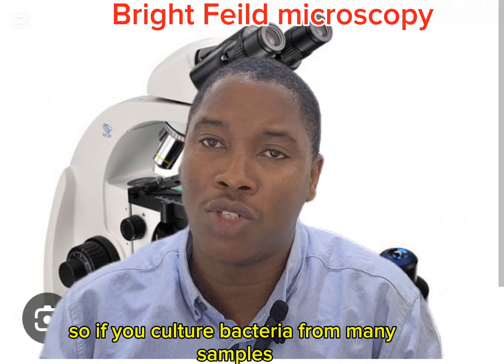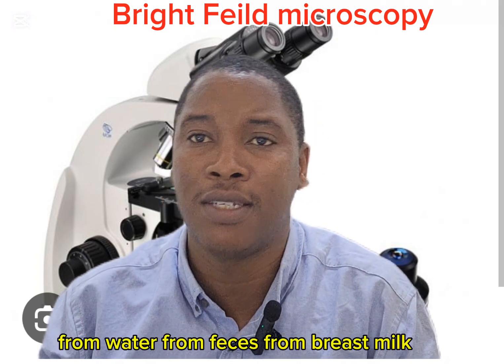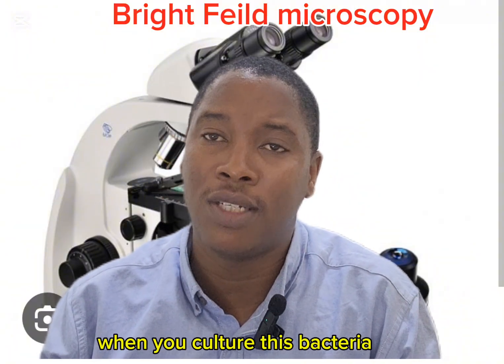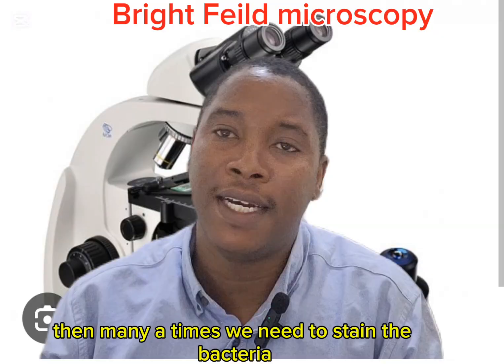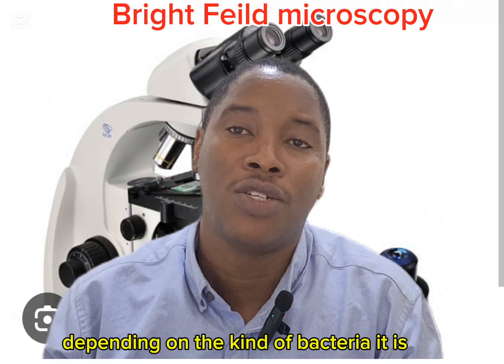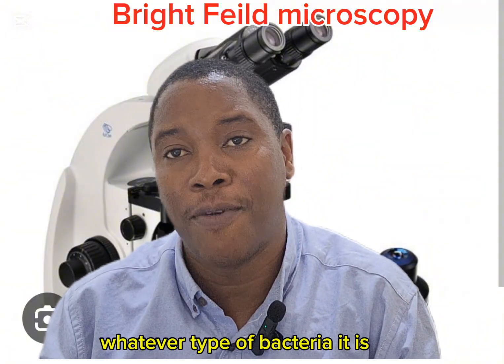If you culture bacteria from samples, from soil, from water, from feces, from breast milk, from whatever sample you're taking, many times we need to stain the bacteria depending on the kind of bacteria it is. So we could do gram staining, we could do acid fast staining.